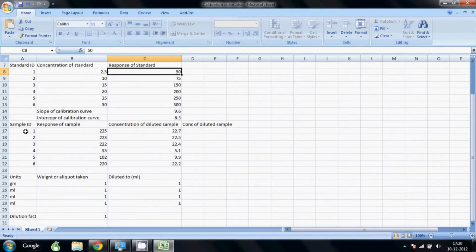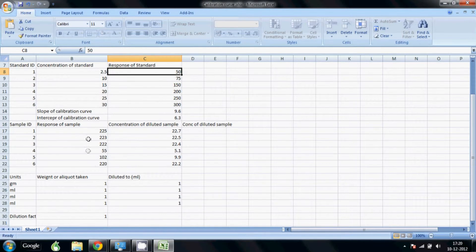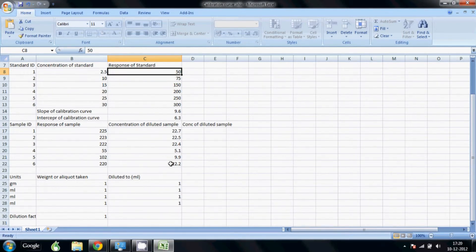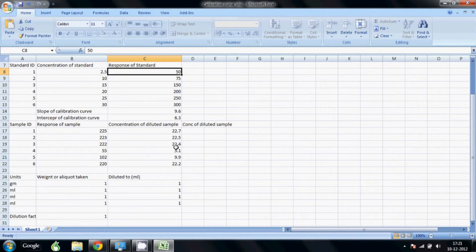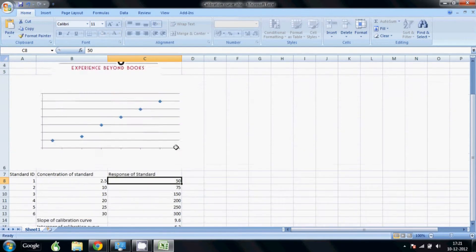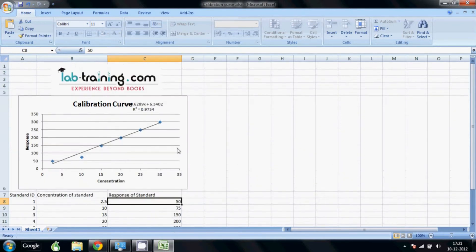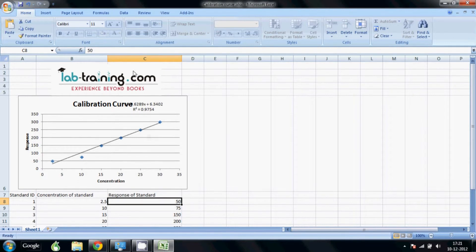And we are going to have place for six samples. Input your sample ID, the response, and you will get your calculated concentration. Also in the bottom we have a dilution factor calculator which you can use to further calculate the concentration of your undiluted sample. So let's get started now.